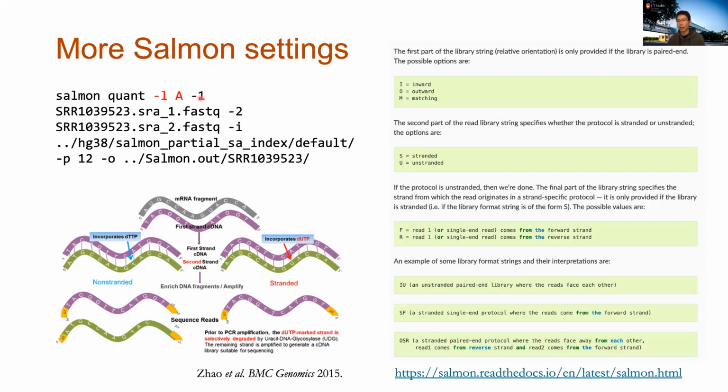There are many settings you can set, especially for the alignment. I mean, with other alignment tools, you can set the alignment criteria, the stringency of the tools. So there are a lot of parameters you can check. For Salmon, we're using the -l, the library type. We use the automatic, I think, so it's A here. It actually has other parameters to be set.